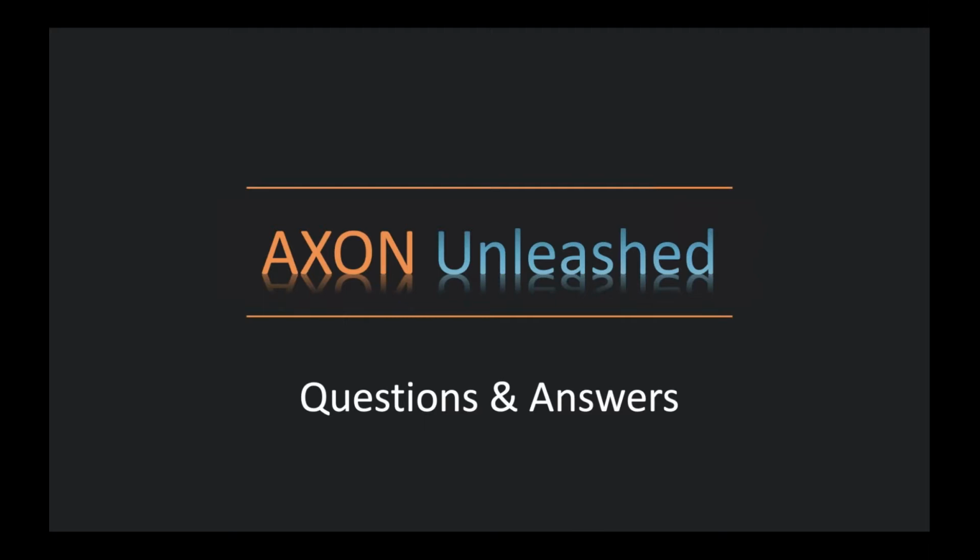So yeah, dose. Everybody, not only in situ microscopy but electron microscopy in general, is very interested in dose control, dose measurements, and certainly dose calculations. This was a pretty big topic of discussion at the Gordon conference for liquid microscopy. Madeline Dukes, our application specialist in the liquid field for Protochips, was there and relayed some of this information back, and we certainly understand why.